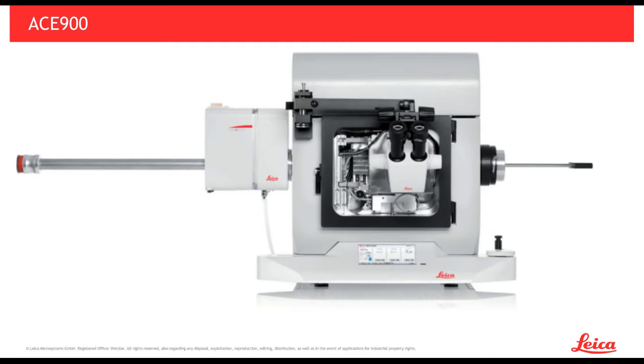Freeze fracture and freeze etching are useful techniques, but they take a little bit of skill to learn. So if you want to do these techniques, patience is required.